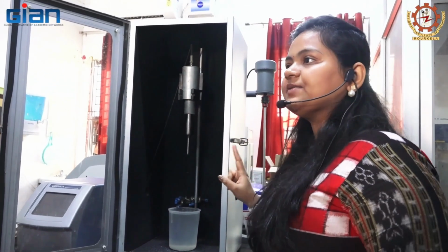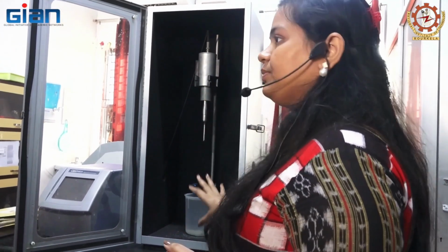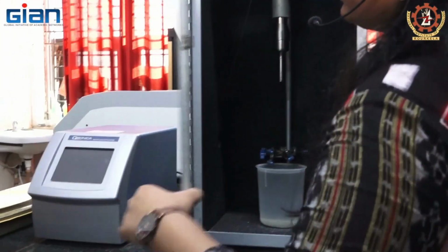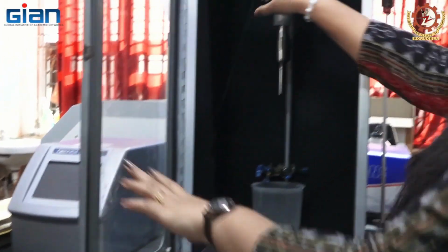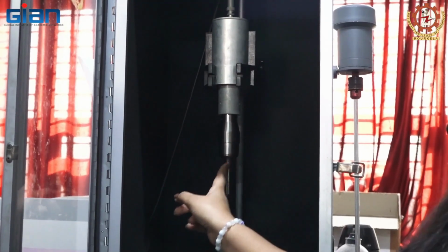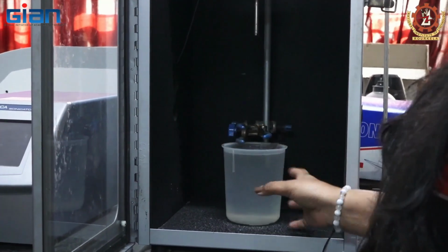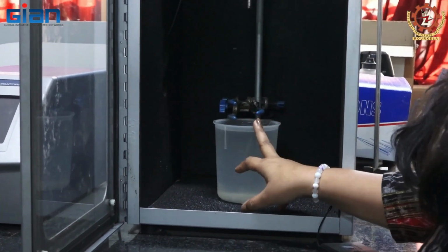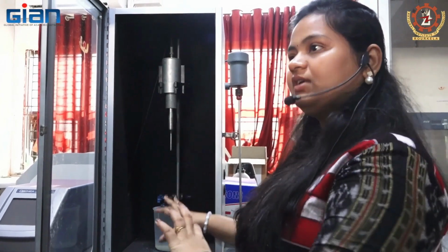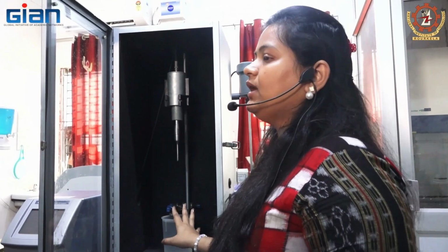Ultrasound extraction has two types. One is bath type and another is probe type. This is the probe type, basically, I am telling you. This is the generator. This is the transducer. This is the probe, or we can also call it the sonotrode. Then this is the extraction vessel stand, and this is our cooling system. Cooling systems are attached in some extractor machines, but here that is not possible. So we have to cool manually with ice baths.